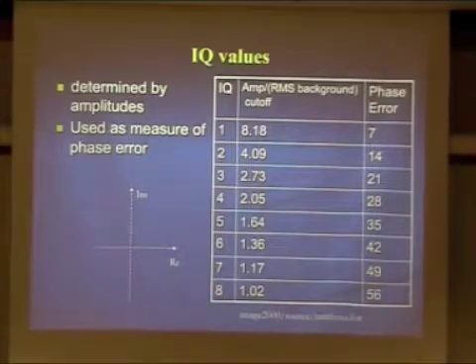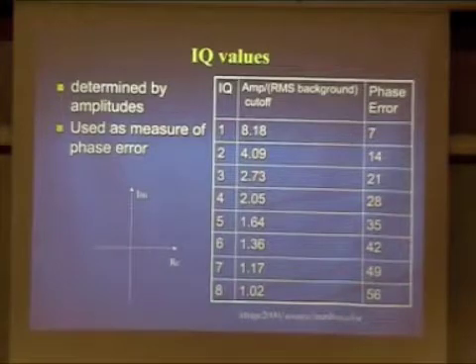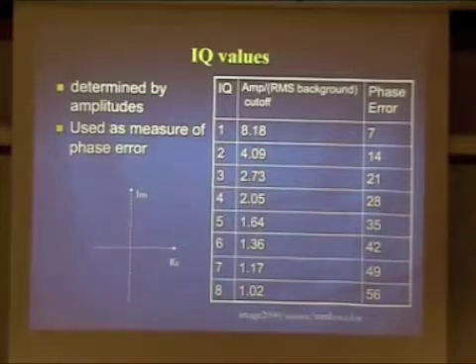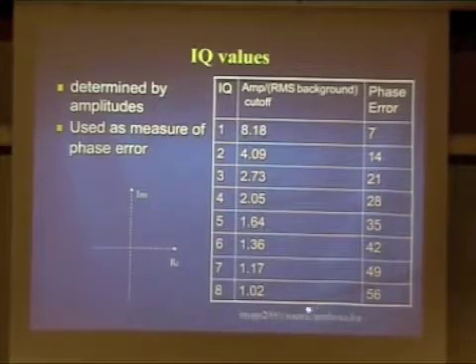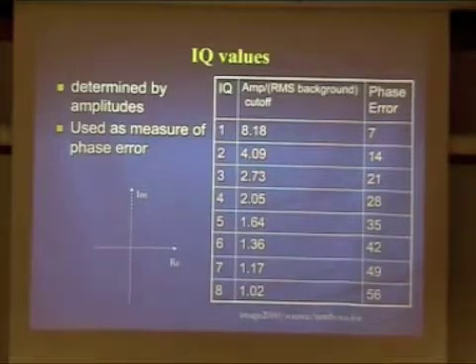So it's not a very strong signal we're looking at in amplitude terms. However, the phases that you can determine out of something with such a low signal to noise ratio are still rather significant. So the phase error that they figure out goes from the highest is only 56, with 90 or 180 as random.